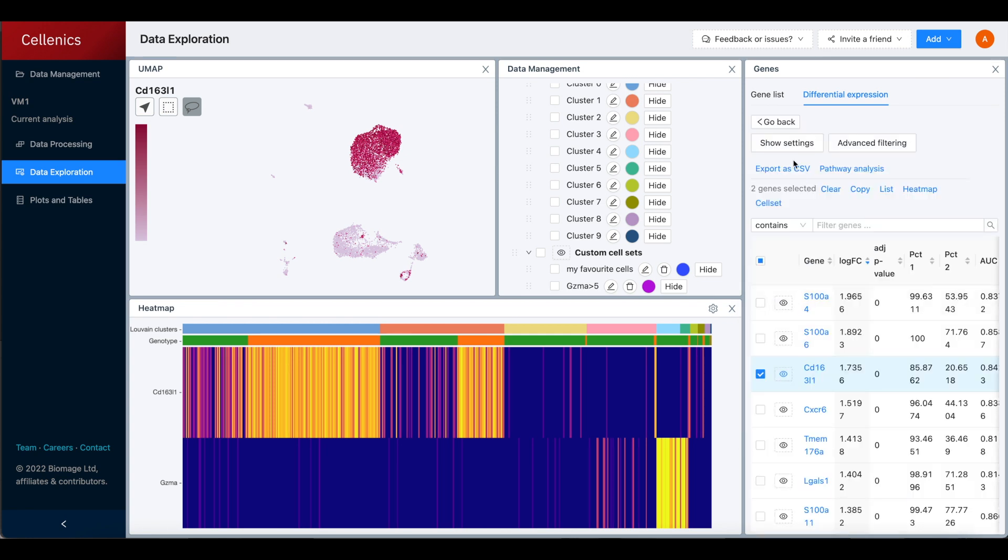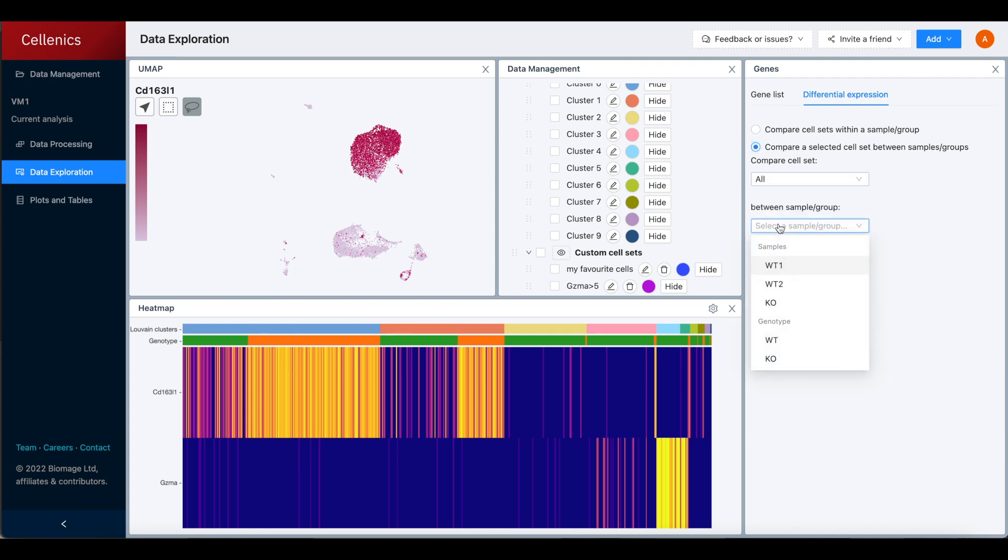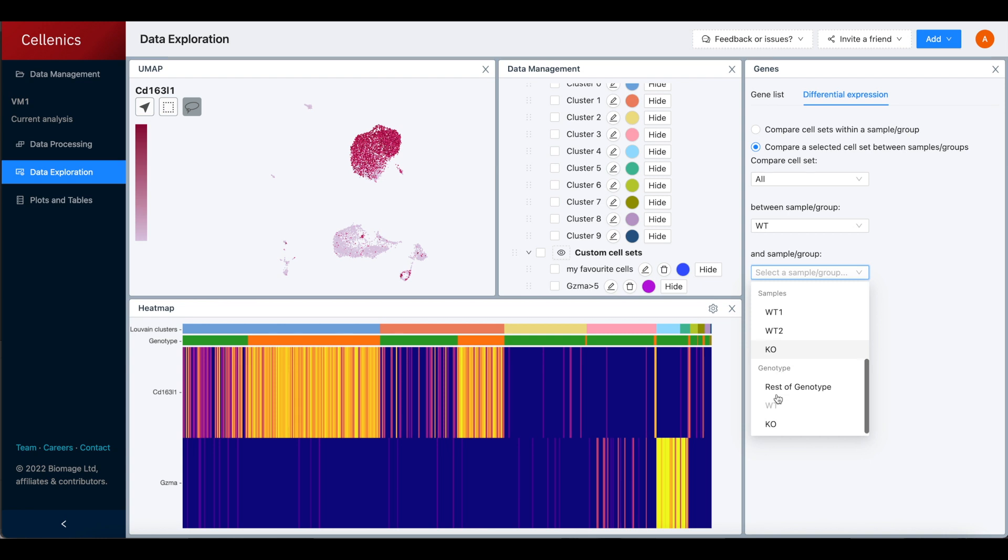Alternatively, you can calculate differential expression by comparing a selected cell set between samples or groups, such as between wild type and knockout in this example.